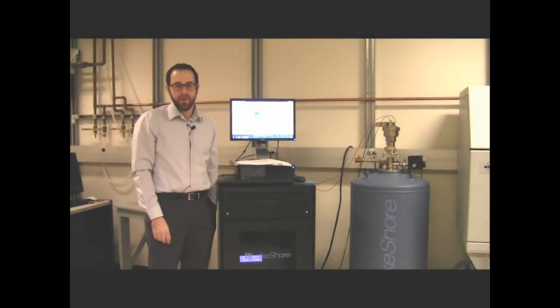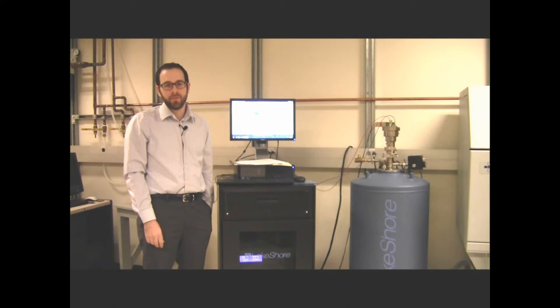My name is David Dalton. I'm here at the ENCOM Nano Systems Laboratory at The Ohio State University to talk a little bit about Lakeshore's prototype terahertz frequency materials characterization platform.